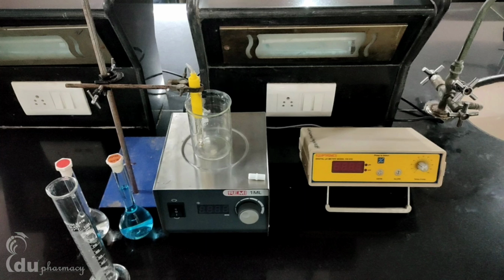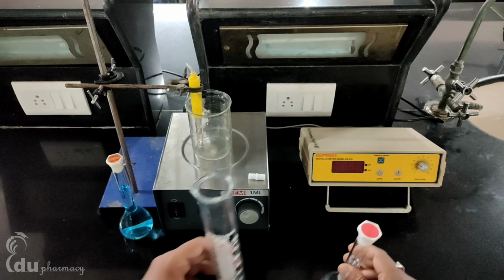Here, I will use a magnetic stirrer in pH titration because we have to record the pH of the solution after adding different amounts of sodium hydroxide to obtain the titration curve. When we add something from the burette to our solution, it has to be mixed properly. Continuous rotation of these magnetic beads helps us to mix the solution properly, and the mixture can attain equilibrium very easily. We must take 75 milliliters of glycine solution into the beaker.